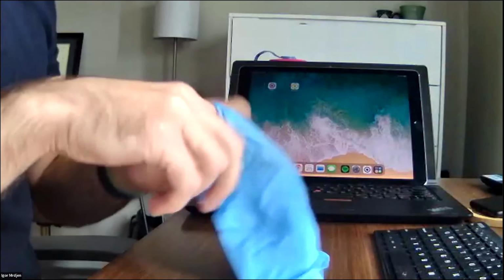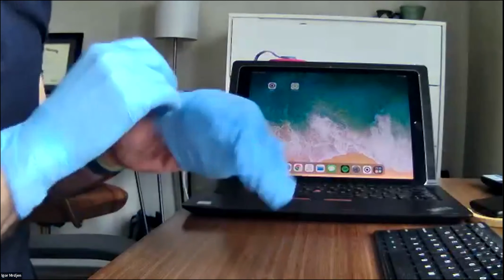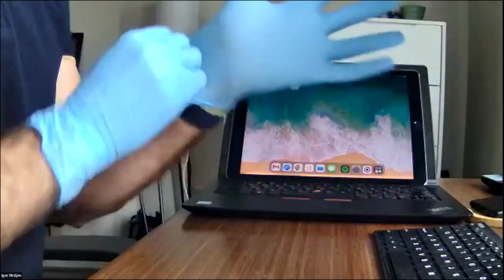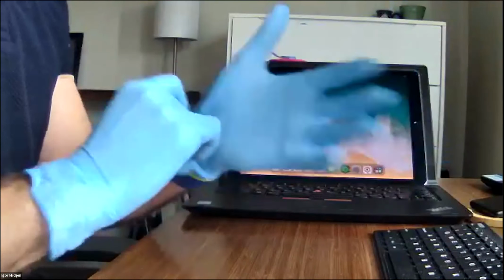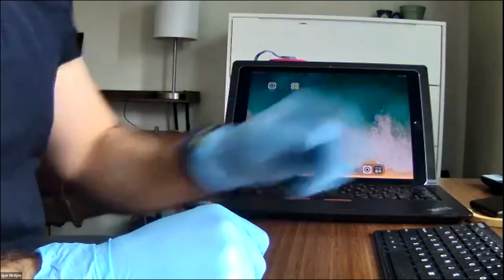But yeah, let's get to the demo. So I'm going to put my gloves on because I collected a HAB sample yesterday, and I think if it's typical to the lake that I sampled, it might be very toxic. So I am going to be safety first, right?